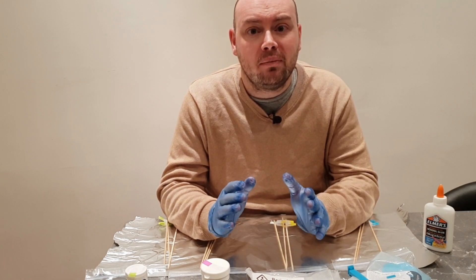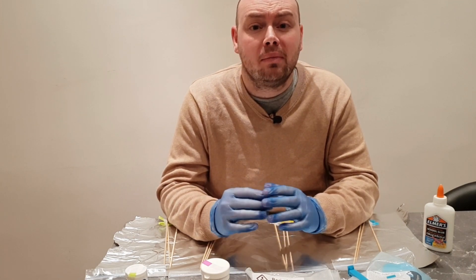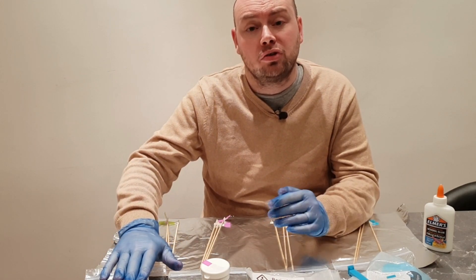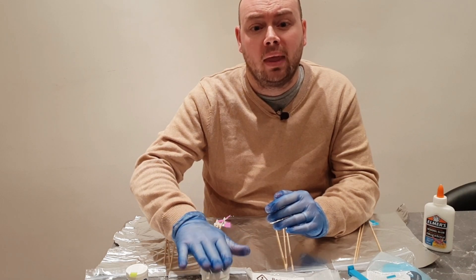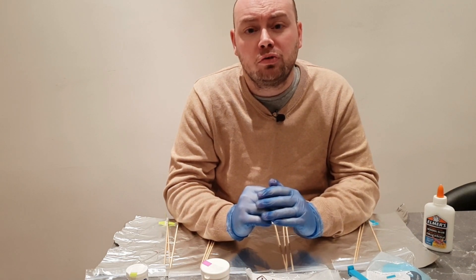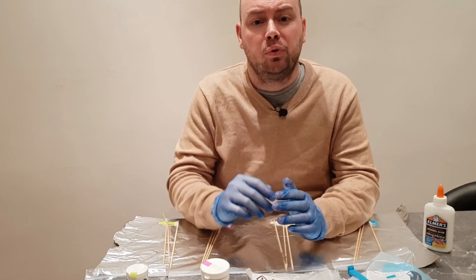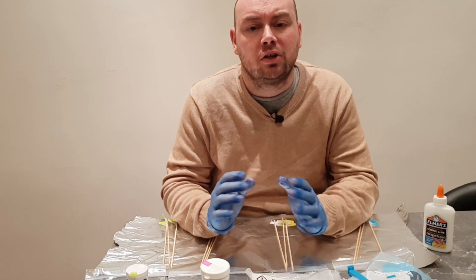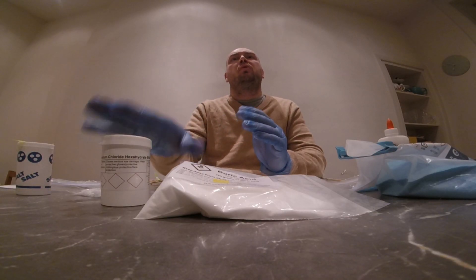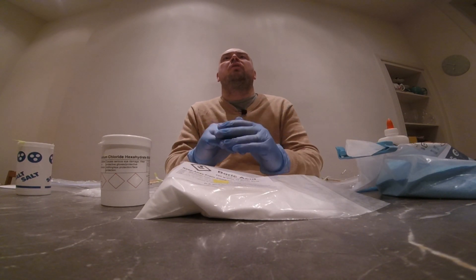I'm going to be burning different metal salts to see what colours we get from them. In front of me I have four different metal salts I'm going to be testing: sodium chloride, which is better known to us as salt; strontium chloride; boric acid; and copper sulphate. I've also colour coded each of these materials — green for sodium chloride, purple for strontium chloride, yellow for boric acid, and blue for copper sulphate — to correspond with colours on different bamboo sticks so I know which stick has which material.